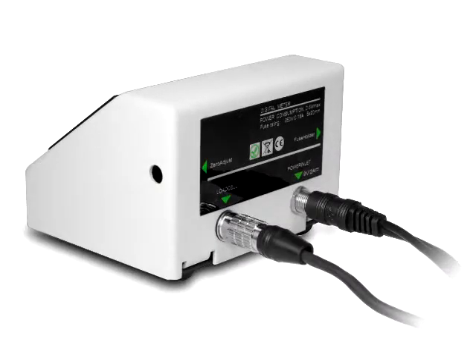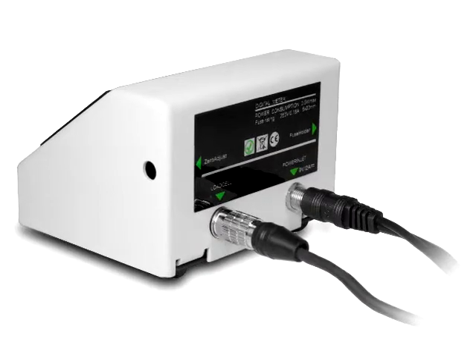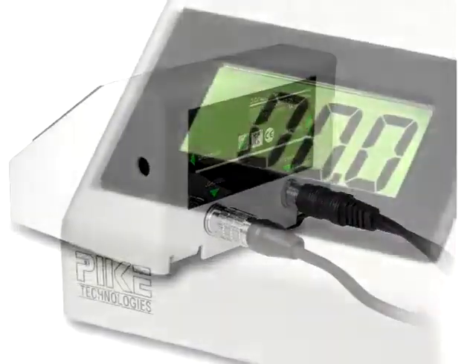Insert the connector of the load cell assembly first, and then the power cord, into the back of the LCD monitor.